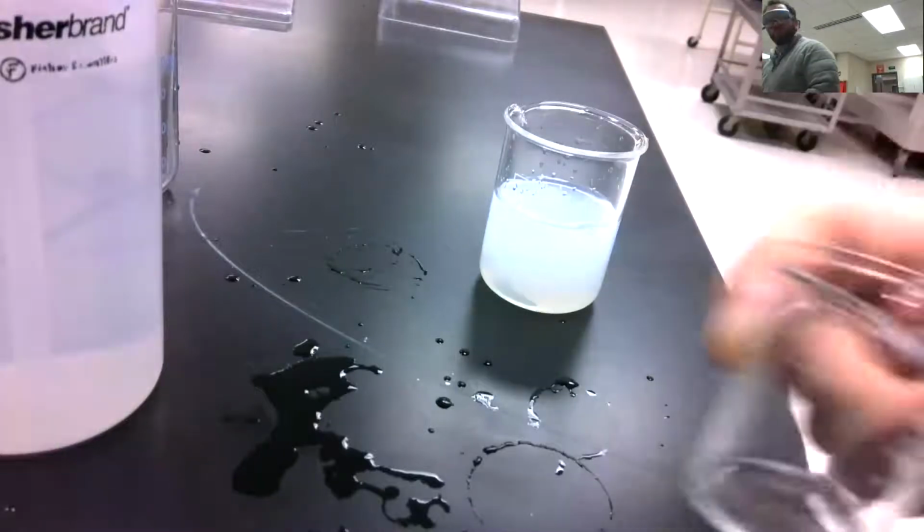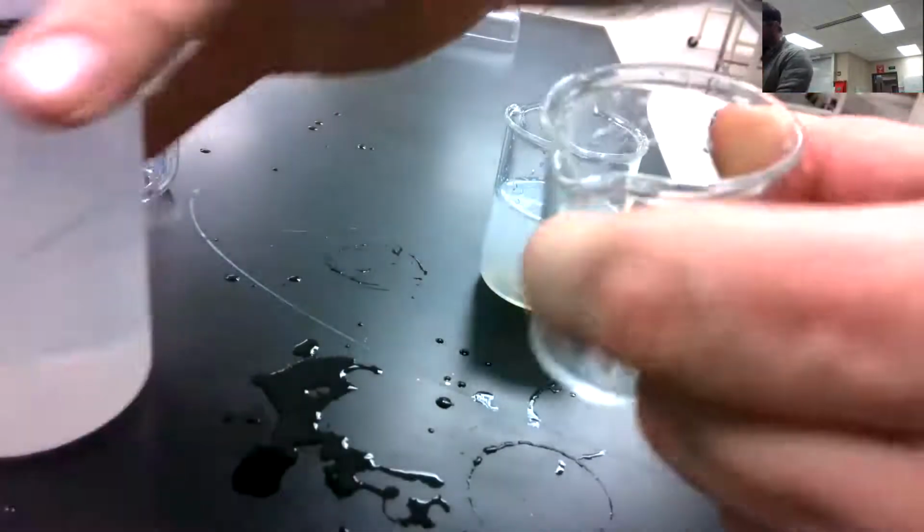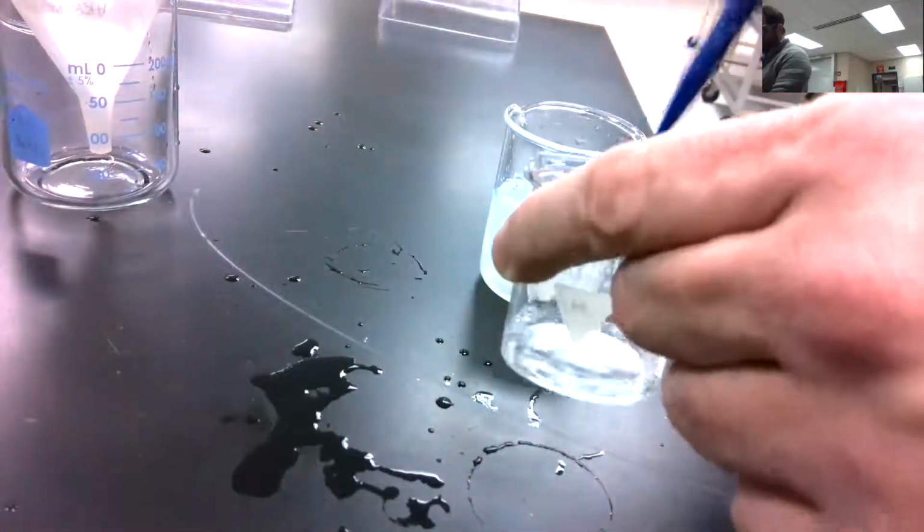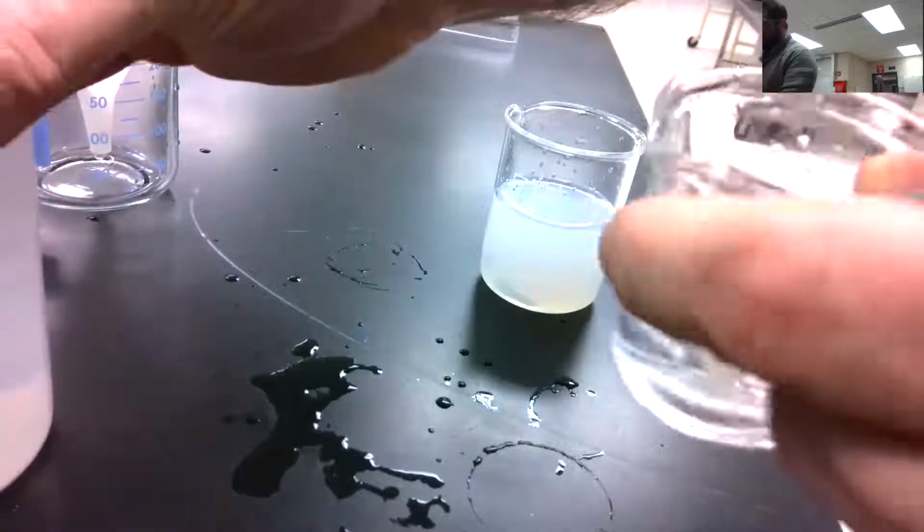I want to give this little one a rinse. There's still some residue in there. I want to make sure I get everything out. Otherwise, I'm not going to have a very good percent yield. So a little rinse here. There we go.